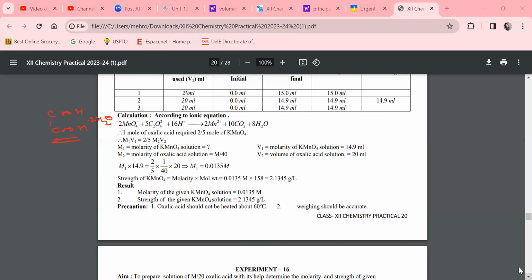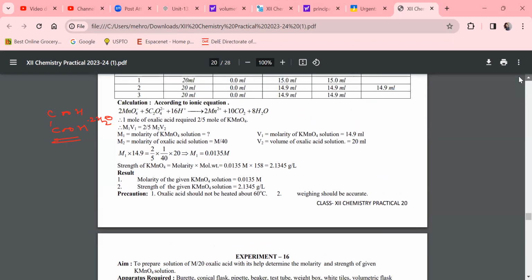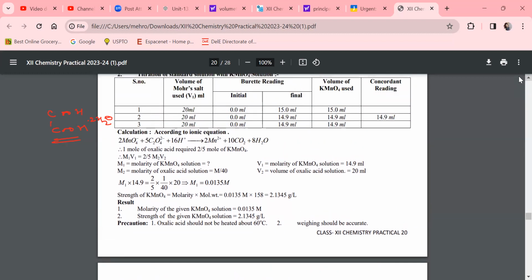And these are the precautions, at least 2 or 3 precautions you can write in your experiments. The pipette should be properly tapped and properly locked. When you are sucking the solution with the pipette, do it carefully. Okay, these are the precautions you have taken during the experiments. And lastly, in the different videos, you can find the solutions of different volumetric analysis titrations as well as different inorganic salts.